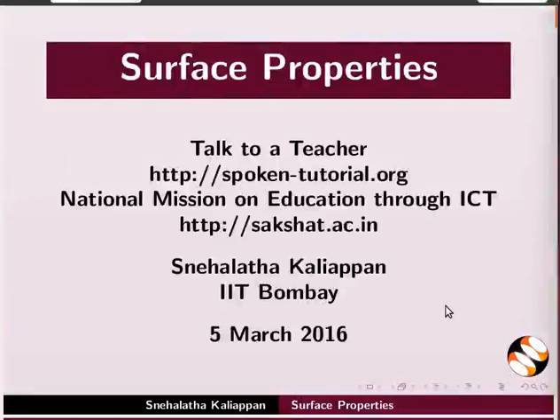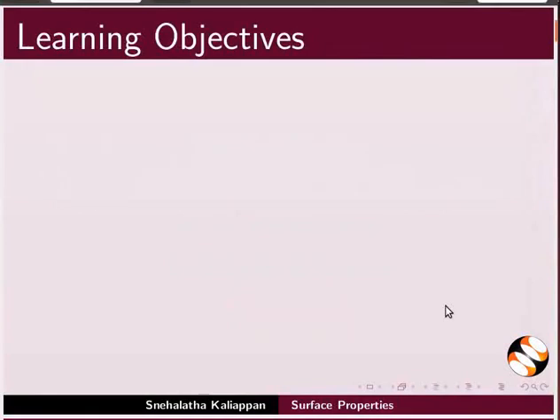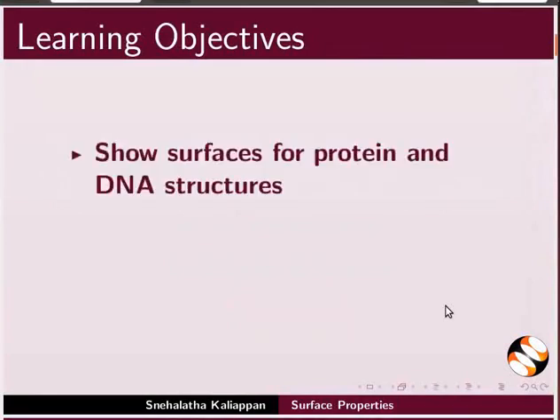Welcome to this tutorial on surface properties in Chimera. In this tutorial, we will learn to show surfaces for protein and DNA structures.